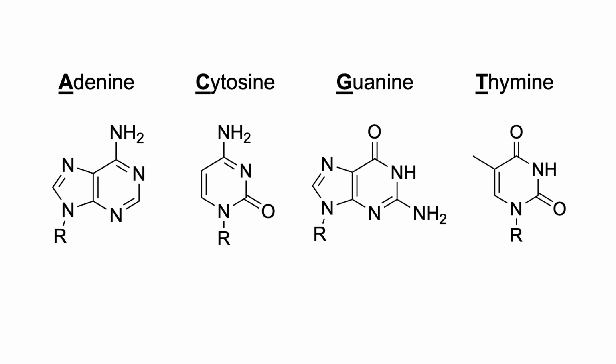So there might be instances where there might be two bands, say like an A and a C, that kind of line up and their peaks really line up, and you don't necessarily know exactly which one to call. And you don't want to pick one or the other. So we need some nomenclature in order to denote if we want to represent either possible 2, 3, or even 4 nucleotides at a certain position. So this is the nomenclature for that.